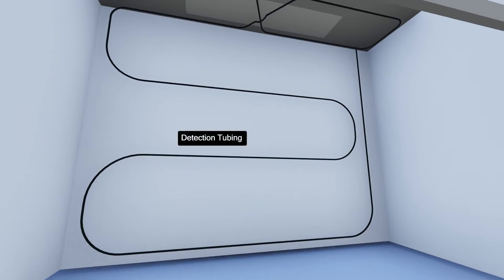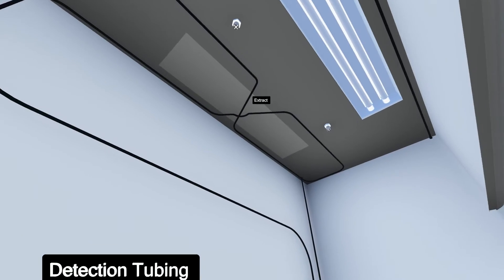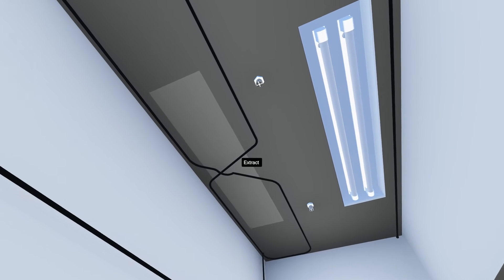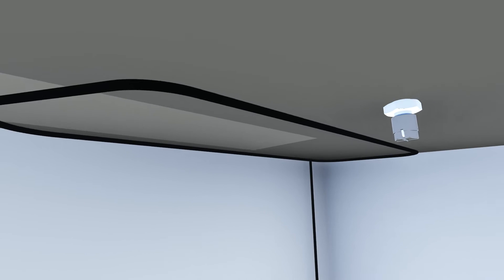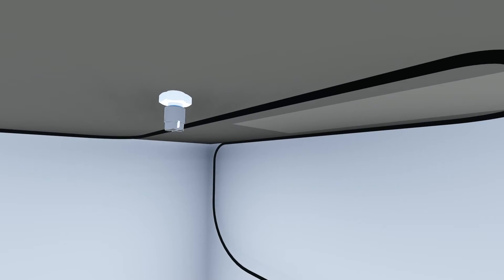A pressurized detection tubing is placed on the roof, across the extract and behind the baffles. Two nozzles are placed at high level to discharge the extinguishing agent.